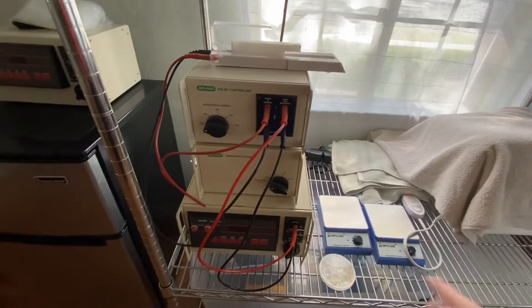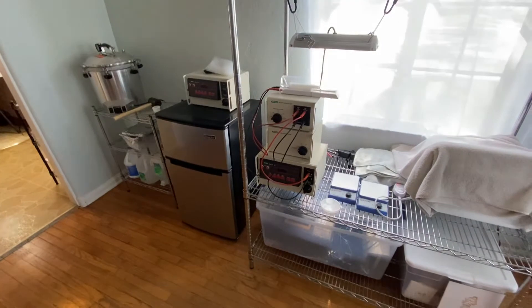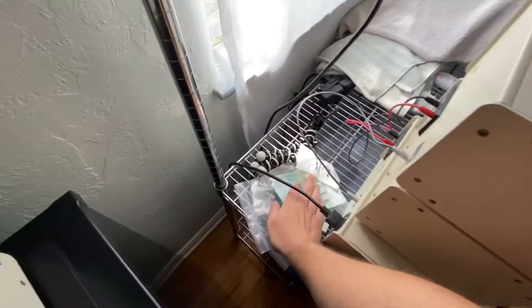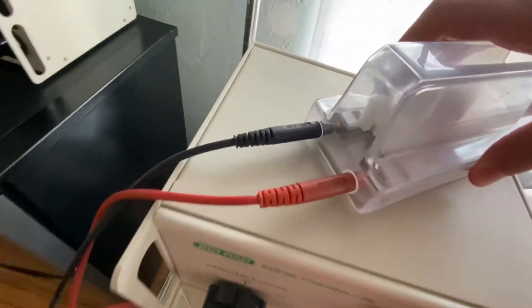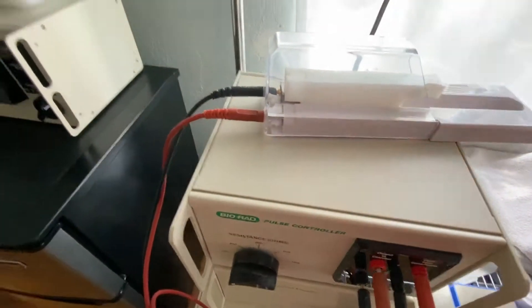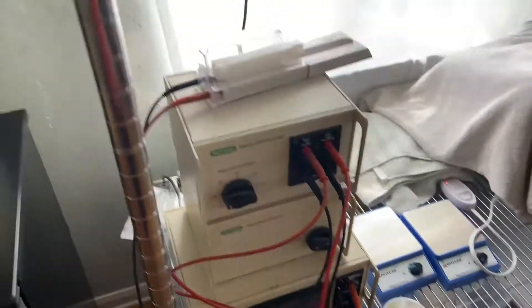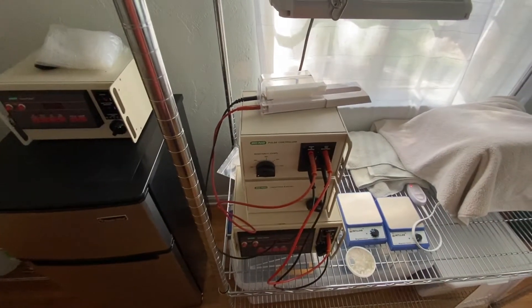The procedure is basically identical between E. coli and agrobacteria. The hardest part about electroporation, based on the testing I've done so far, is preparing the cells — preparing competent cells, as they say. These are the cuvettes. We put the bacteria in that little gap along with some DNA, that goes into this little machine. The contacts make connection with the electrodes, and the whole thing is just an apparatus that shocks the cells.